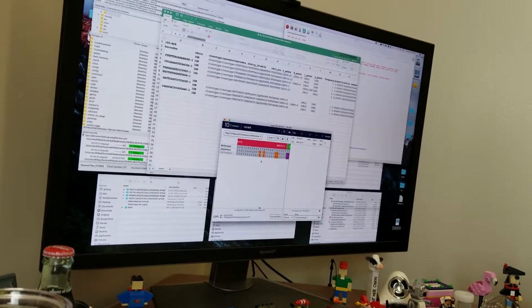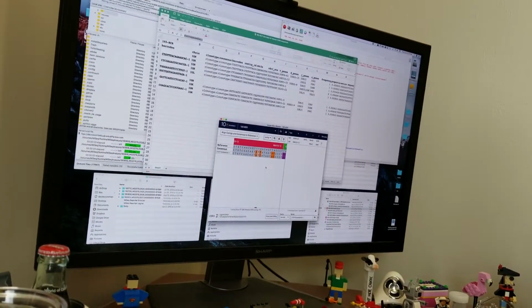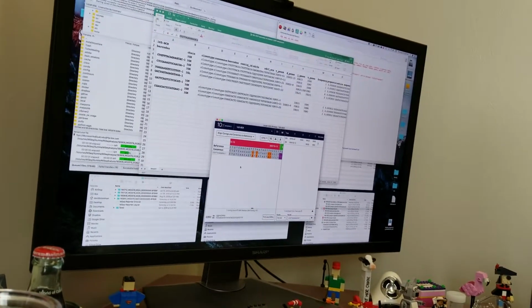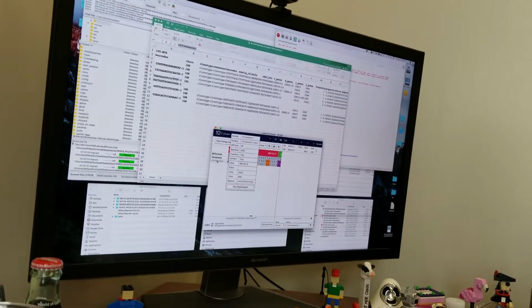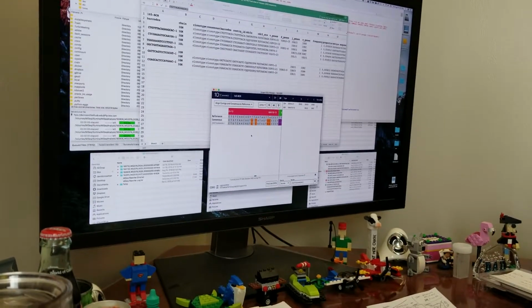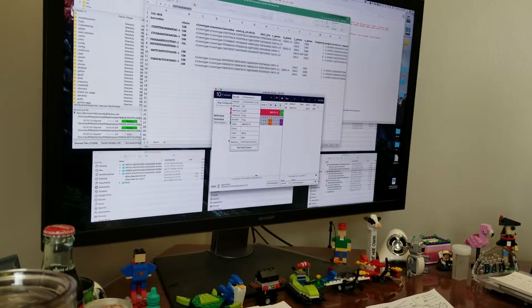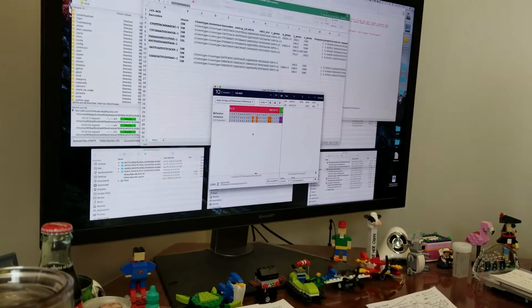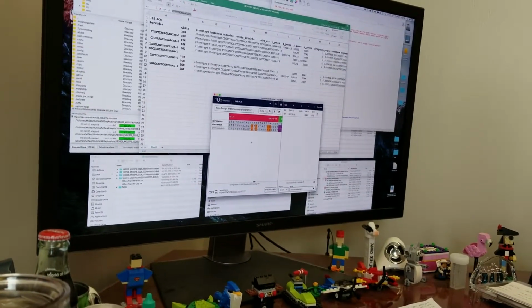Is the reference our sequence? No, the reference is the reference from the genome. The genome, right? So the consensus is consensus from our sequence. Correct. If you had multiple barcodes listed here, it would then say, here's your consensus based off of all of those. But since there's just one barcode showing for this particular sample, that's the same. But it's one barcode, but it's 5,000 sequences. Correct. Yes.